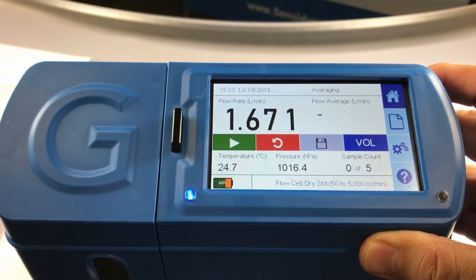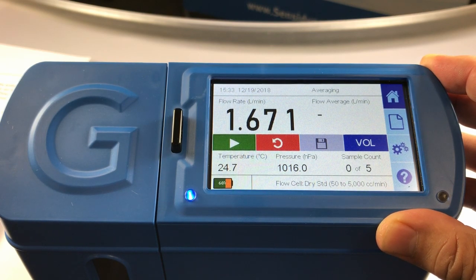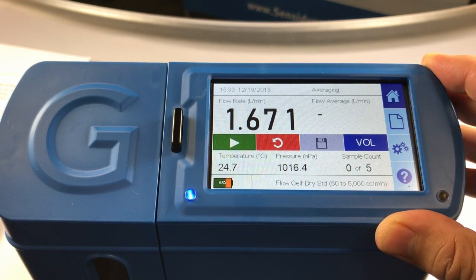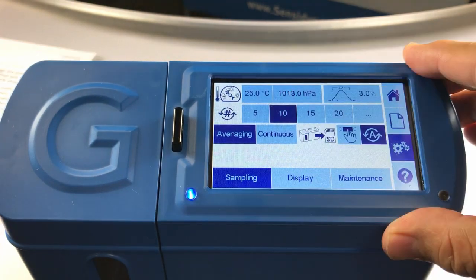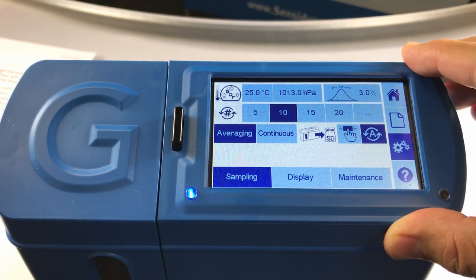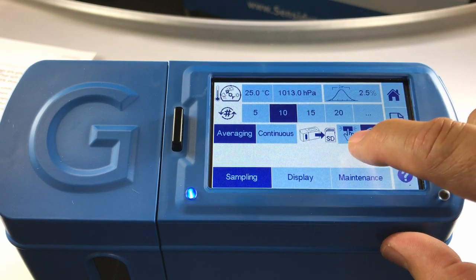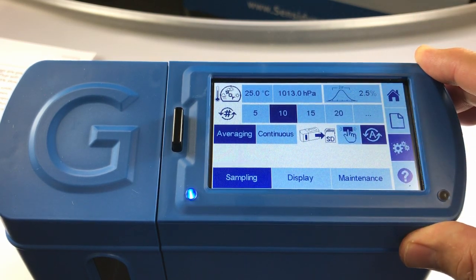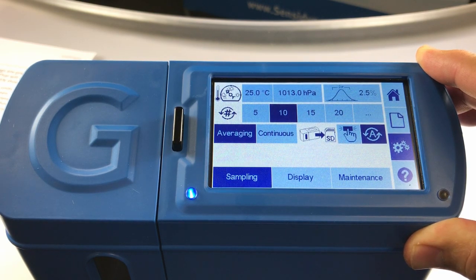For this calibration I'd like to take a sample set of 10 samples. I can configure this by entering into the settings screen and selecting 10 from the menu options. I also want to make sure that my readings are precise, so I will set my statistical threshold to 2.5 percent. That will alert me if my percent deviation is outside of my 2.5 percent threshold.